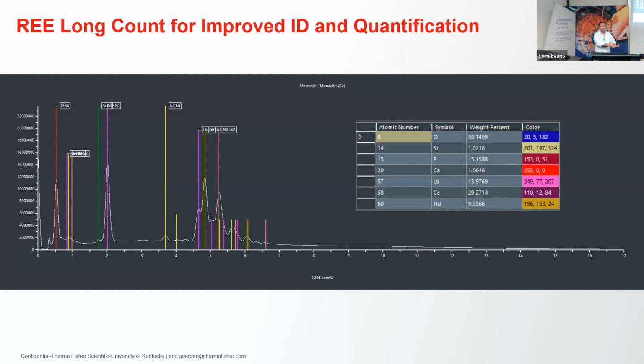For example, when you have laser ablation ICP-MS and you want to do isotope analysis and trace element analysis, you can use this information to quantify the major and minor elements and let the ICP deal with the trace elements and the isotopes, the ones that truly shine as the benefits of a system like ICP-MS or laser ablation ICP-MS, which we're working on, by the way, quite recently.